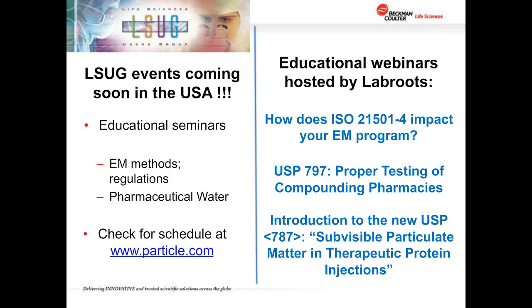Oh, that's great. Our next question comes from Dominique, who asked, our question concerns the new ISO 21501-4. What about concentration limit measuring during calibration?